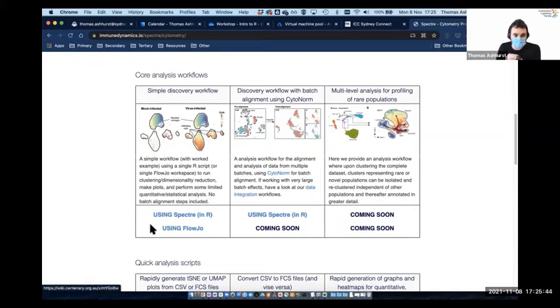We've also got a version of this protocol where you can replicate these steps in FlowJo. This type of approach doesn't have to be done in R. You can replicate this in other programs. The reason we like doing it in R is because it gives us a couple of things. One is a different way of scaling up our analysis, but also automating a bunch of it. What we find by using R is we can manipulate the data or reconstruct the data, and do different things to it in a way which is fairly seamless and very reproducible.